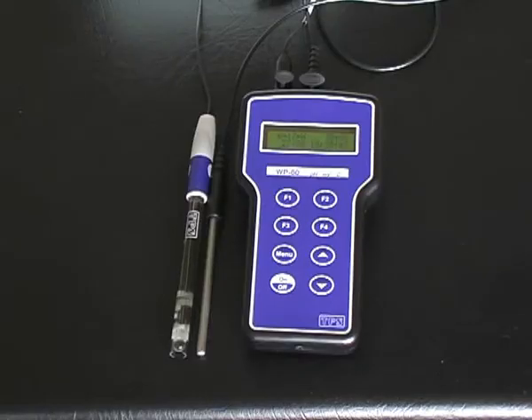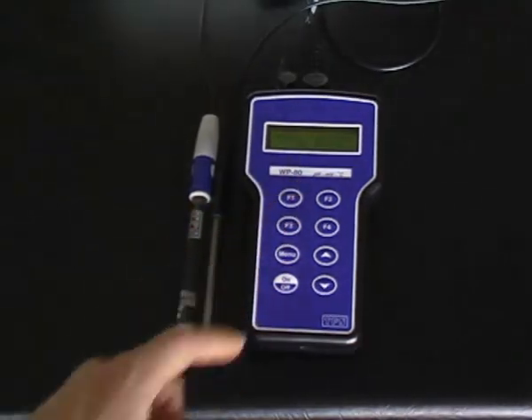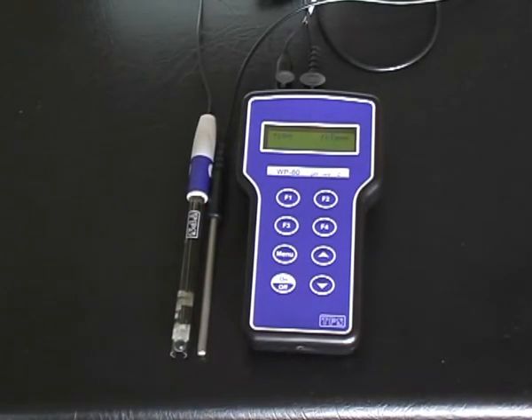To calibrate a TPS WP80 pH meter, the calibration procedure is the same as the 90FLT. First, press menu and then press F1 to cal. To complete the cal, however, press F1 instead of Enter.